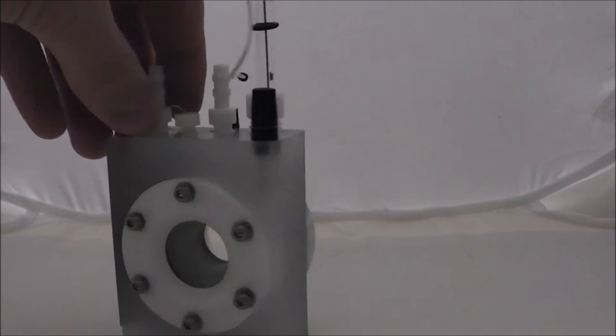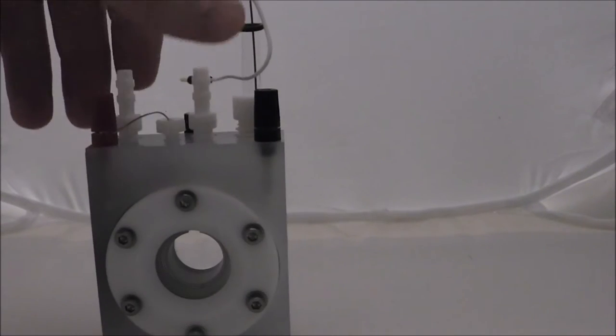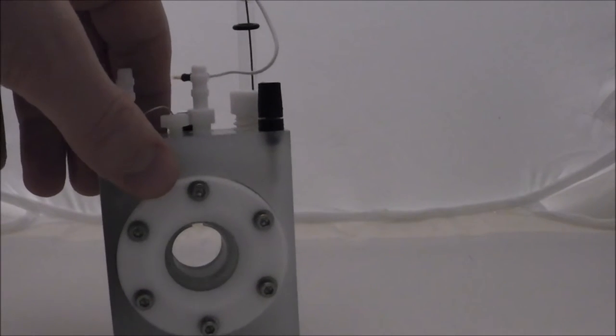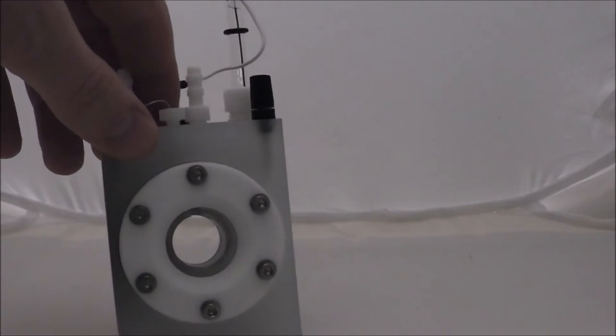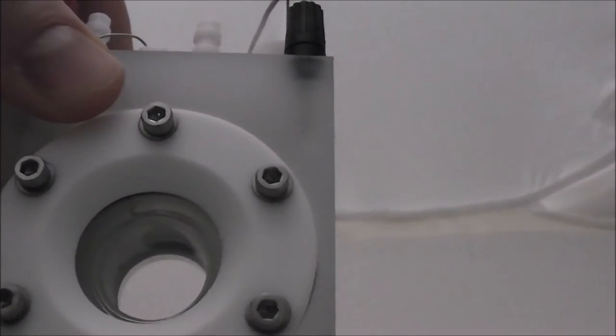There is a port for a reference electrode. By standard, it comes with a silver-silver chloride reference electrode. There's also a platinum counter-electrode.